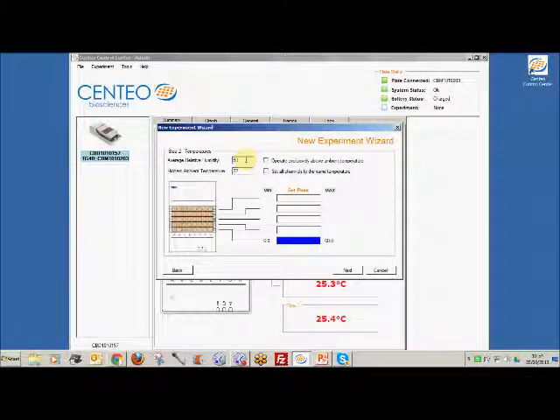Now if you have yourself in a very nice, I'll reduce this to 40%, keep that at 22, you can see that it stays at 60, but if I reduce that to 35% and I'll reduce this to 20, it then allows you to do 4 degrees upwards, and that's a good range. People like to work between 4 degrees and let's say room temperature, so being in an air-conditioned room at 35% with an ambient temperature of 20 degrees gives you a good working range. Now if you put this into a room at 18 degrees, then you have an even better range in operation again. Some people have these in anaerobic chambers where the relative humidity can be really, really low because it's basically in a dry atmosphere.